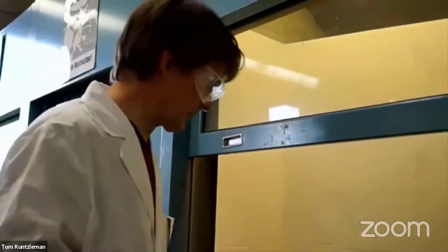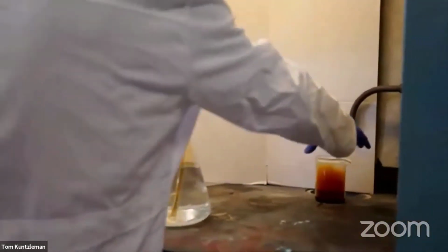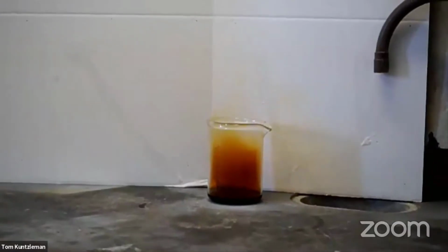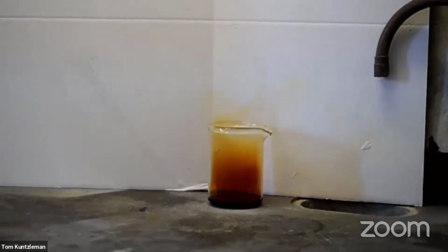Let's do one more experiment. One more to go. I'm going to place this over in the other hood. We'll keep this focused on this reaction here. Pop this over here. One more reaction I want to do.